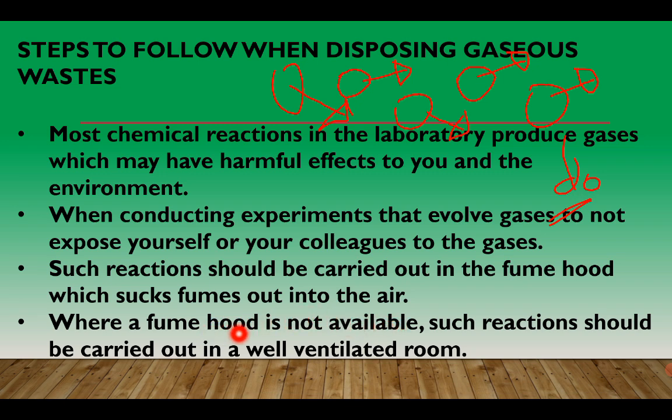So keep windows open, doors open. Don't carry out chemical reactions that produce gases in a closed lab. Make sure you open the windows and the door, so that as the gases are being released, they diffuse to the surroundings outside the laboratory.